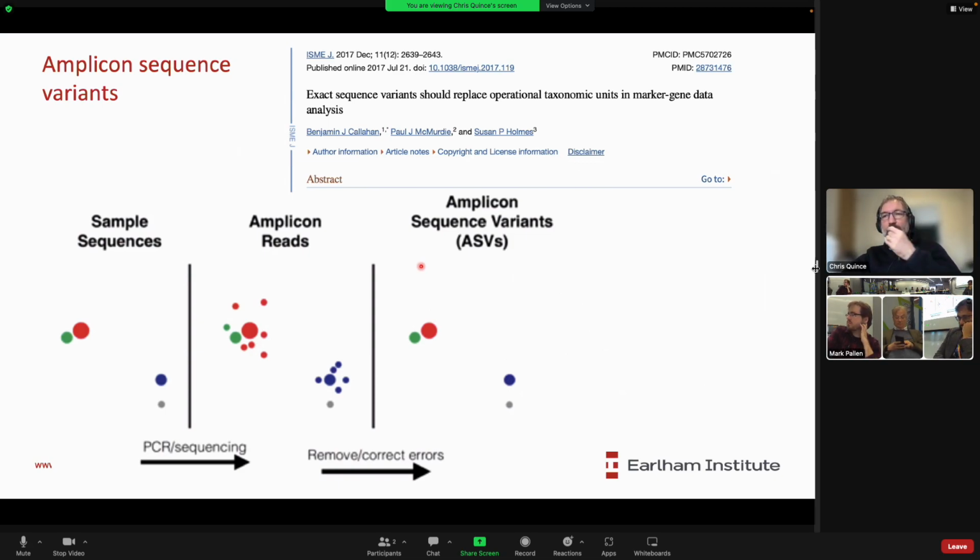There are reasons, though, why I still think there could be some advantages to forming OTUs after forming your ASVs. And that's because OTUs give you a well-defined measure of sequence diversity. So say you're interested in how many different things there are. If you're looking at ASVs, you're counting even a one base change as a new thing.